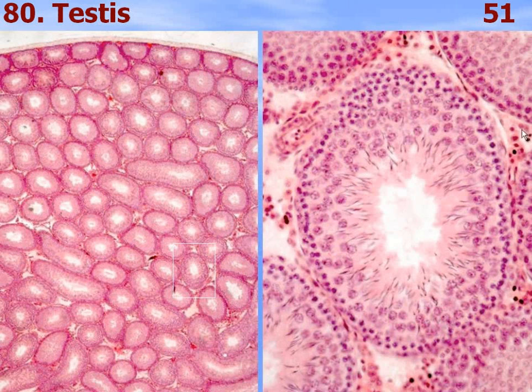Between the seminiferous tubules there is interstitial tissue with endocrine Leydig cells, which produce the male sex hormone testosterone. You can also find numerous blood vessels here.